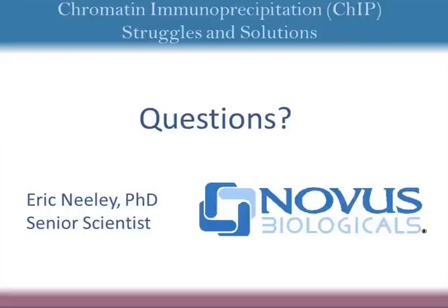I think you're both right in that in a Western blot, we're looking at a denatured and reduced protein. So in a ChIP assay, we're looking at something that's in its native conformation. It's not denatured or reduced. So if it is an antibody that isn't performing well in Western blot alone, you might want to look at it in a non-denatured and non-reduced native state and do a native PAGE, or possibly doing a combo, doing the pull down. Like I said, if it works in IP well, then usually it works in ChIP well.